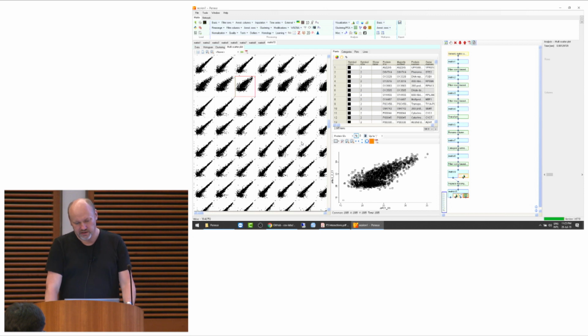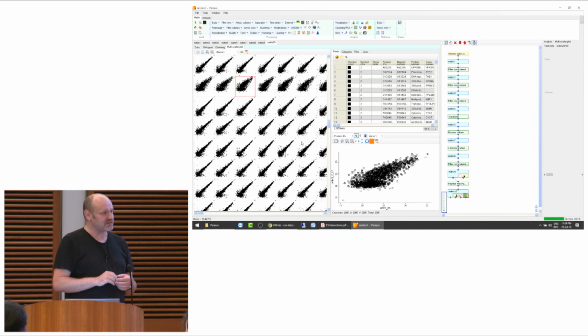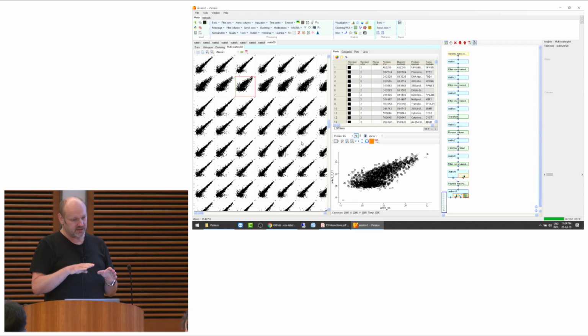Yeah. So I think in all expression proteomics examples, you would do that. You would not do it so much for pull downs, because here the intensity information itself actually carries a lot of information, because that is telling you if it's an interactor or not, basically. So you don't really want to do the z-score for pull downs, but for all kinds of other situations you want to do it, because then you're typically looking for proteins that have similar profiles, but independent of the scale, basically, right?